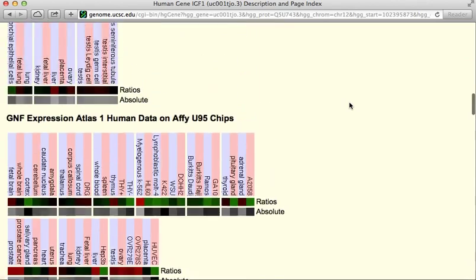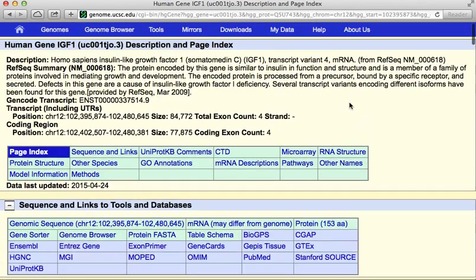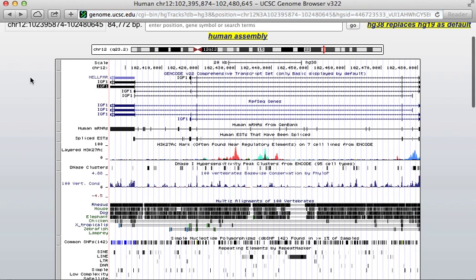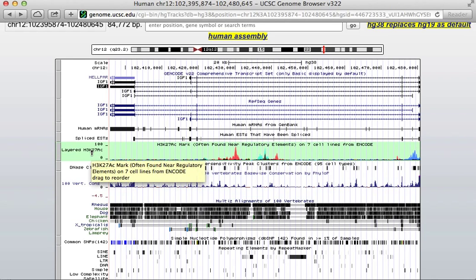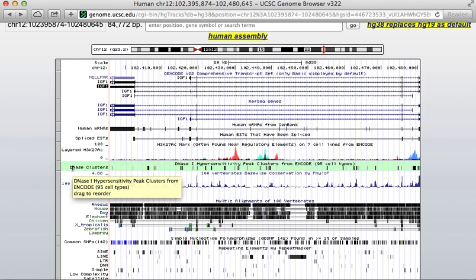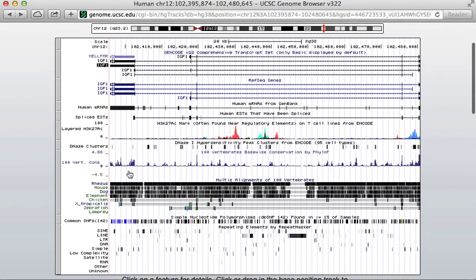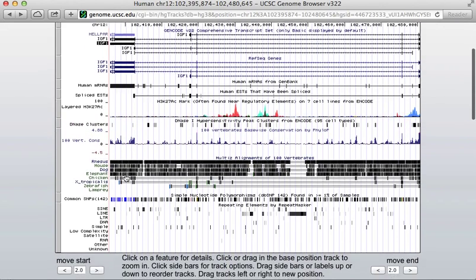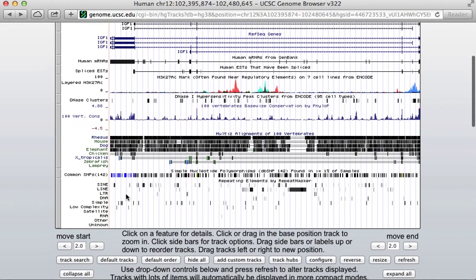Remember, it has this for every gene in the human genome as well as in many other genomes. I'll go back to the genome browser itself. Other tracks that are displayed by default include information about histone modification marks, DNase sensitivity, conservation among different vertebrates, common SNPs, and different kinds of repeats.